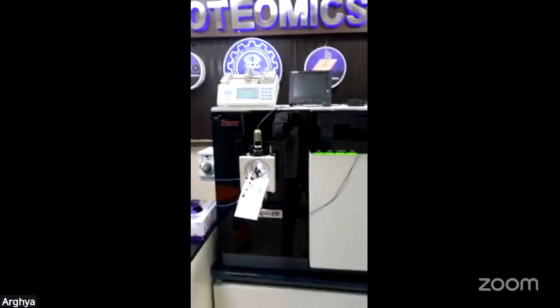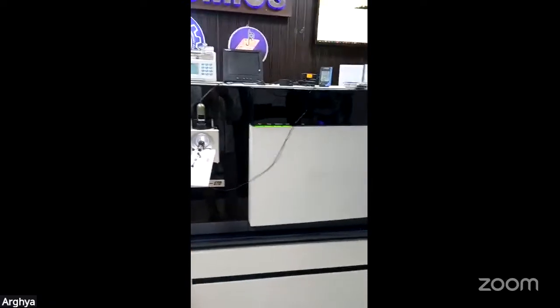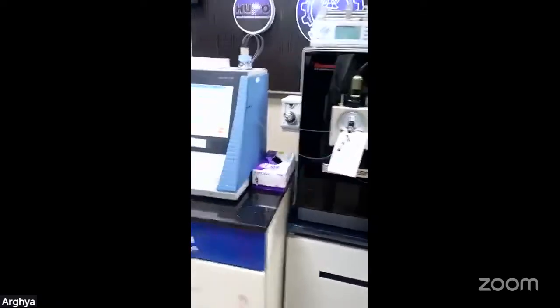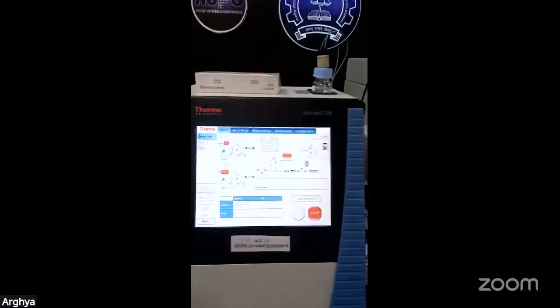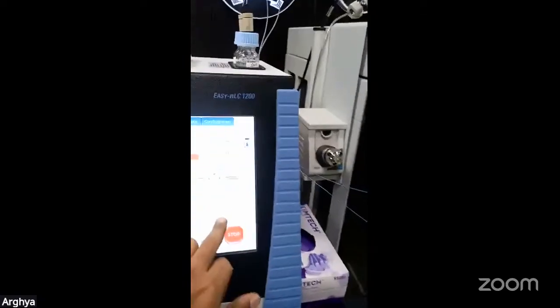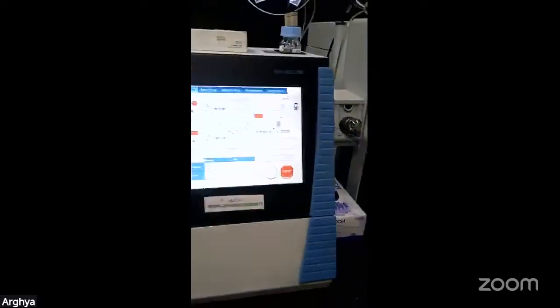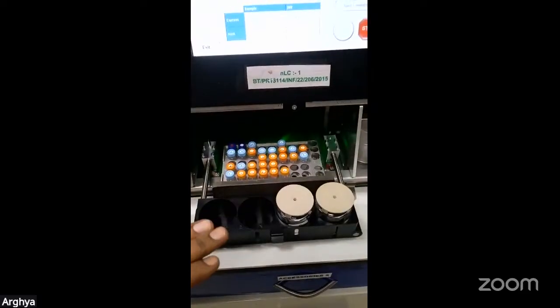the MS-based interactomics. So this is the Orbitrap Fusion, what you are seeing. This is a hybrid mass spec. It has a robust capacity of doing both global as well as targeted proteomics. This is a nano LC. You can find this is a nano LC because it is specialized for only proteomics workflow. You can place your samples inside the sample tray into the nano LC.